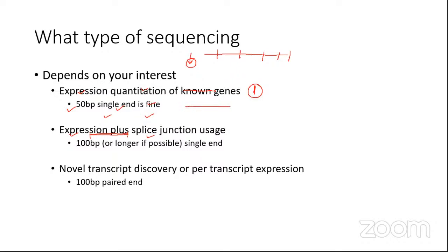So better to go for a little longer base pair read. Again, if our splice site is present between repetitive regions, then again we will miss that with this short read. So better if we know the splice site, which kind of splice site we are looking for, then decide whether you want to go for short read or long read.